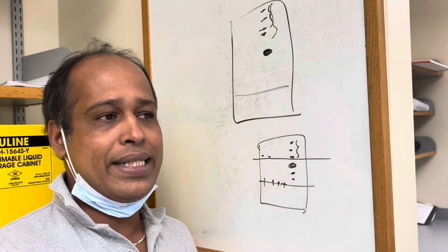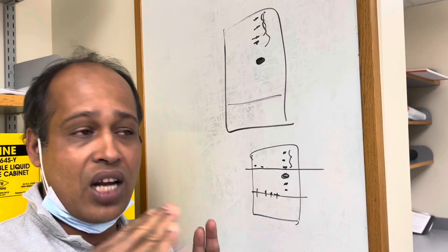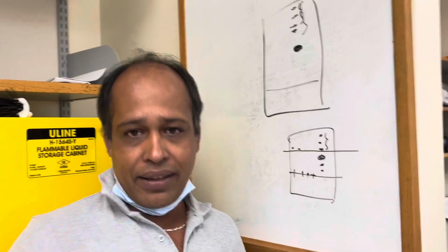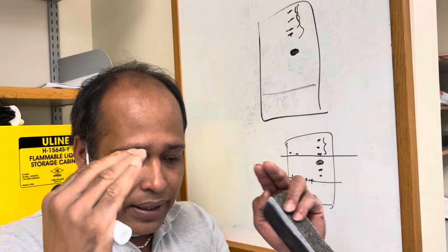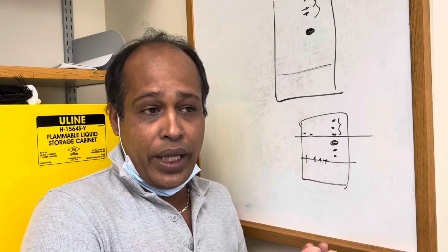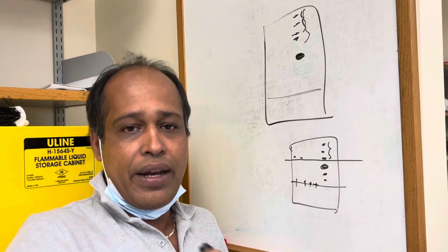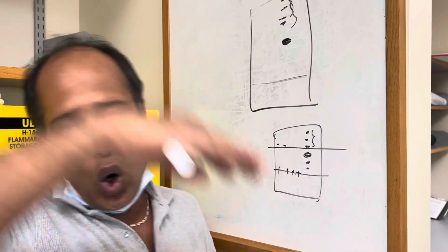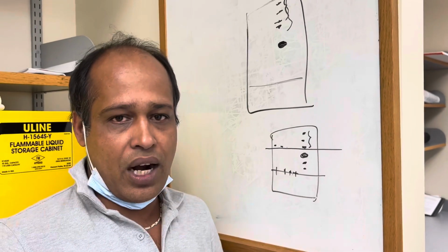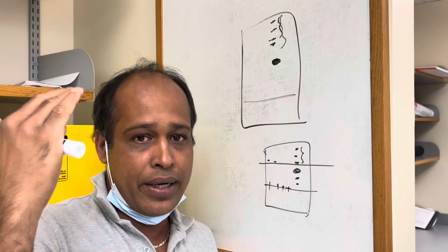That's why I said just study the crude when it is a new reaction. Study the crude with different solvent systems, run the TLC, check that, and try to understand and get the idea what is going on there. Once you know how to handle this purification, then the next time you don't need to do all those preliminary TLC or study things. You can always do the same or a similar way because you will already know.